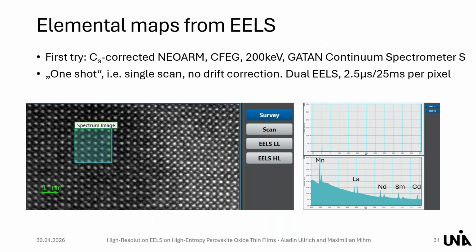The other question is, I think, about the conditions of the microscope, some of which you mentioned. So the spot size, the C2 aperture. Yeah, the spot size, it's a JEOL instrument. The spot size was spot 8, or 6 or 8, I was not sure about this. I guess it was spot 6 that we used, so a little bit more intense. There's a 40 micrometer condenser aperture, 2 centimeter camera length for the EELS, and a 5 millimeter entrance aperture for this spectrometer. Okay.